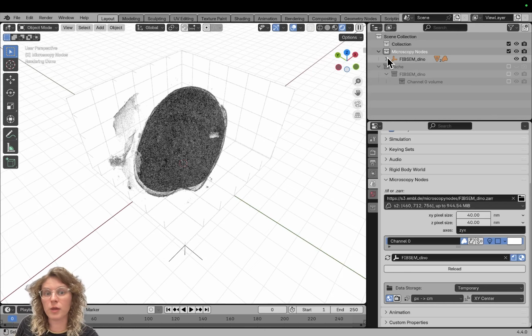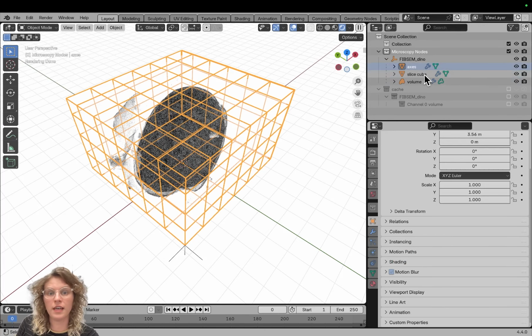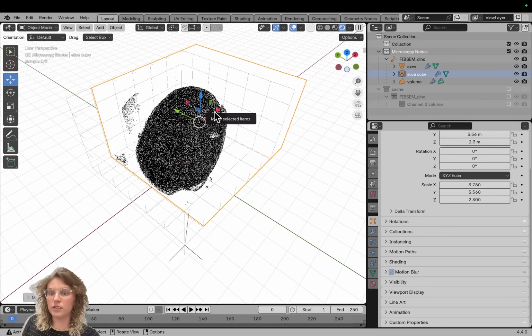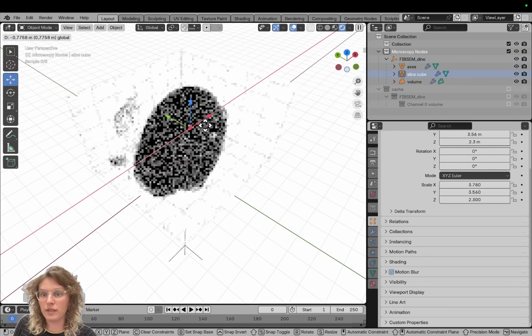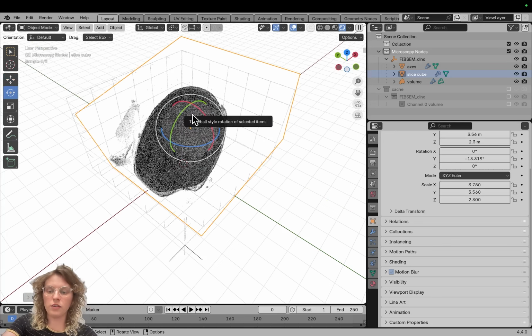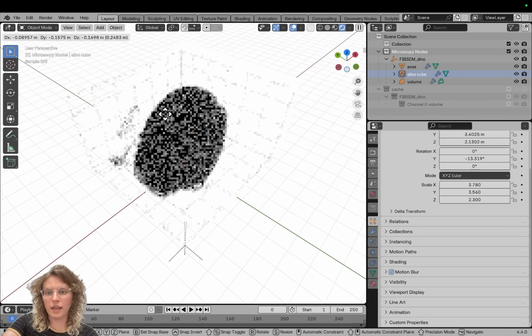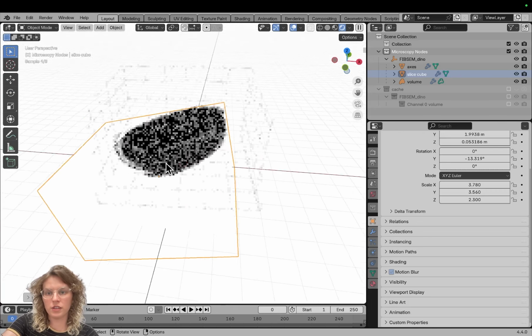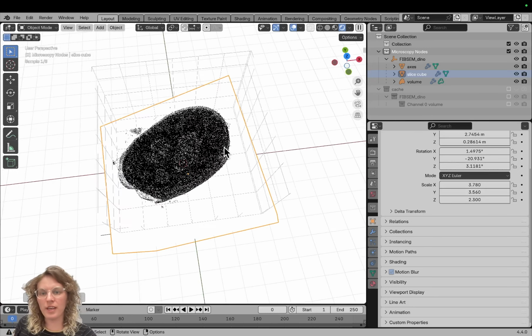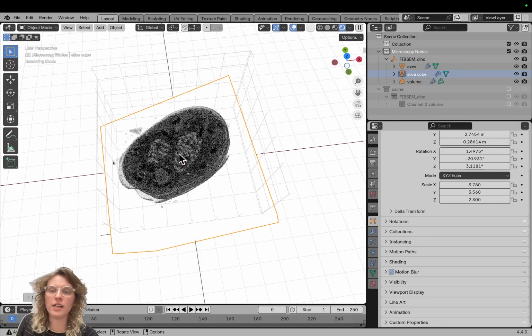And here we have a summary of all the things in the scene, so we can see that we have the axes, and we have a slicing cube, which we can move either with these widgets, and like rotate it, or with hotkeys. So I usually use G, R, and S for this, but I'm also not that used to using the widgets. And then we can actually find that we here have our two nuclei, because this is a dinoflagellate right after it has divided.